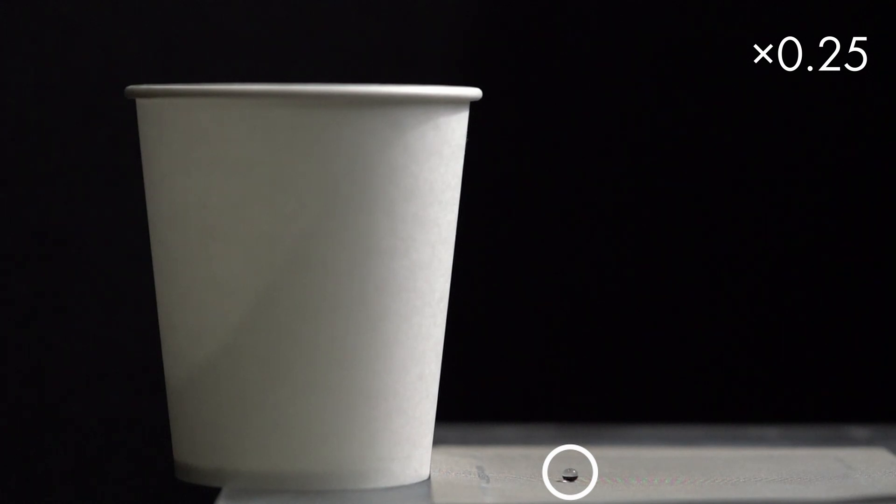When the sound pressure at the focal point exceeds a certain level, the droplet detaches from the surface and jumps into a container.